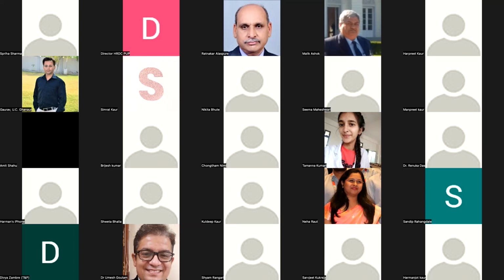Now, another example, like you were asking about functionalization: there are some examples of chiral columns also, and chiral columns are coated with cyclodextrin or some other chiral separators, and you can separate alpha, trans and cis, or you can separate dextro and levo, these D and L isomers, very easily.